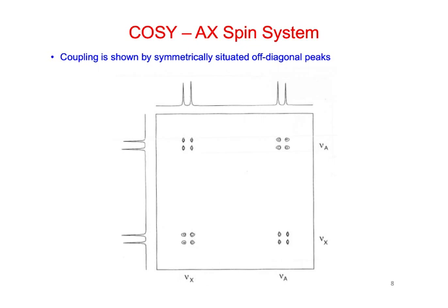Okay? And so this is a spectrum where we have an AX spin system. Remember, that means we have two peaks that are far apart, but they're coupling with each other. And so this is what we saw for the one-dimensional: these two are coupling with each other, this AX spin system, just two doublets.